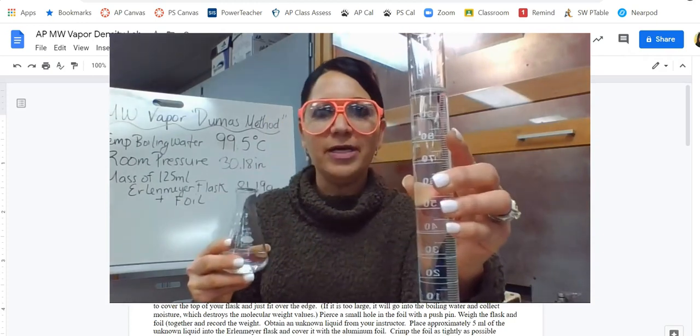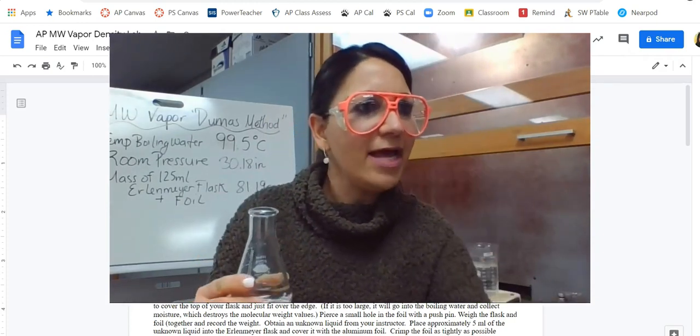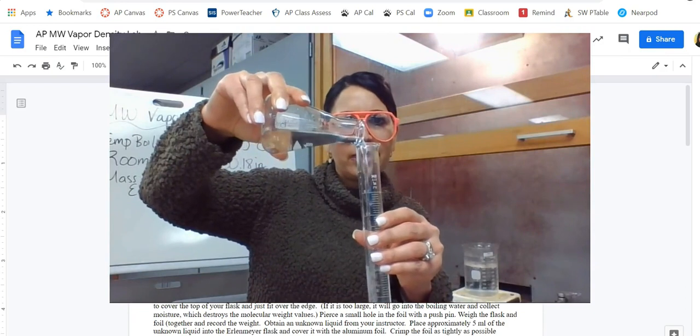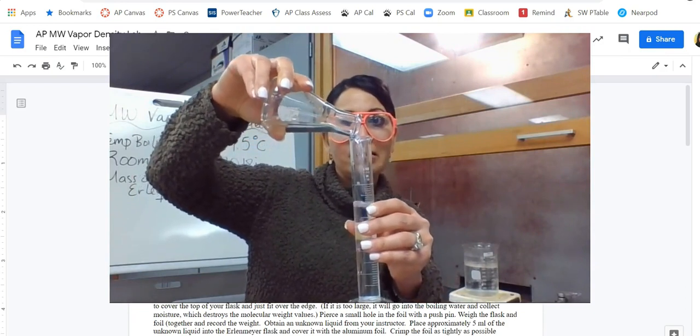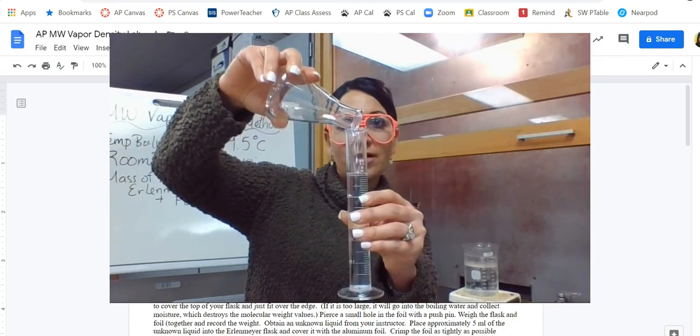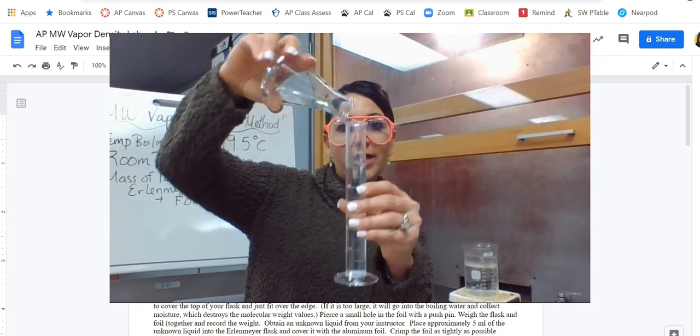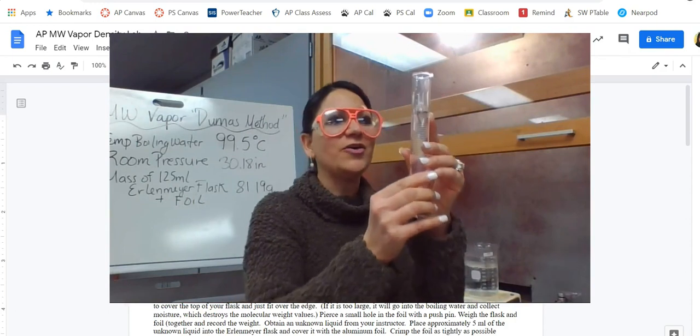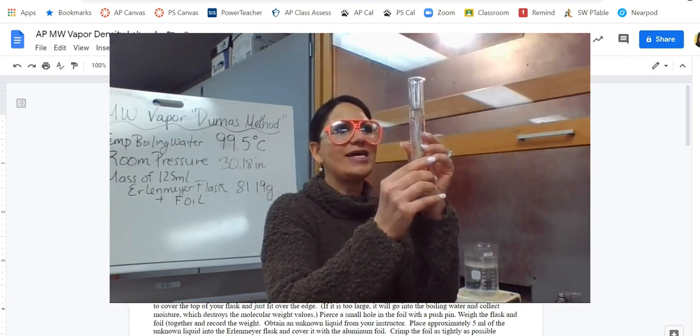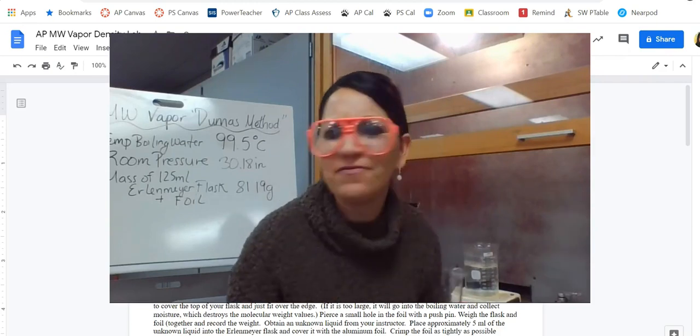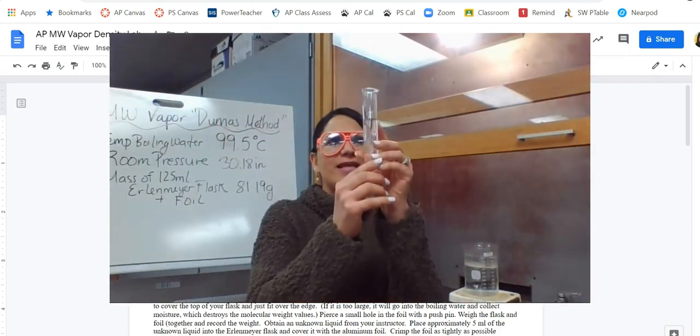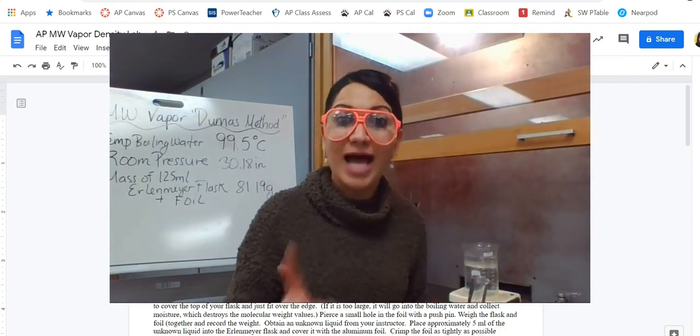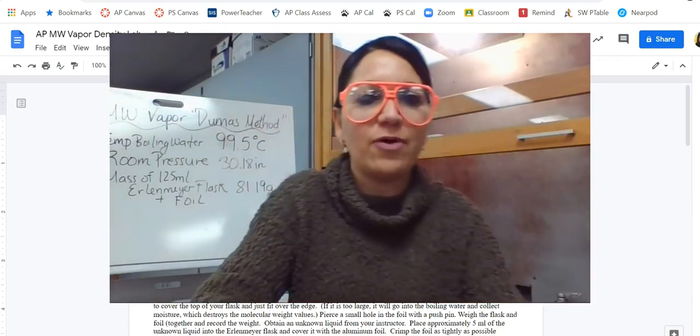Okay, so I've got my 100 mils right there, right at the meniscus. And then I have a 50. I'm not using a 25 because I know it's definitely a lot more than that. So let's go with a 50 and let's start pouring it in here. Hopefully it's not more than 50. Okay, so actually, I'm looking at this, and it's like right at 149. I'm going to say 149. Actually, it's a little bit less. It's 148.5. So we're going to go with 148.5 milliliters. Not liters, milliliters. So that's the volume is 148.5.